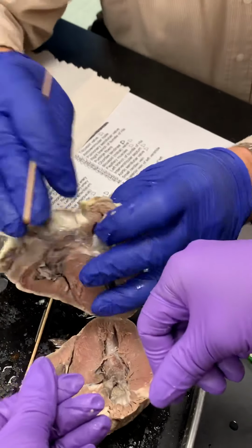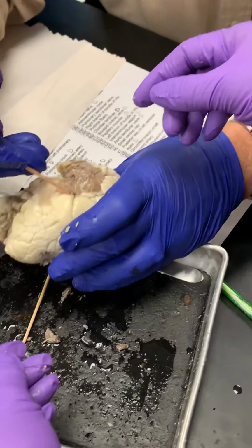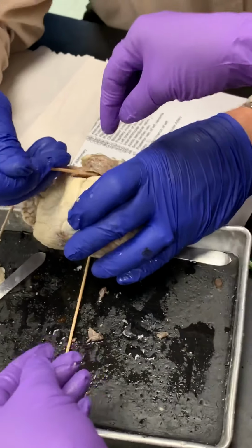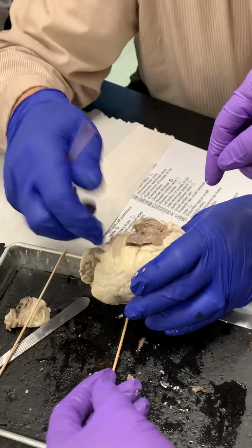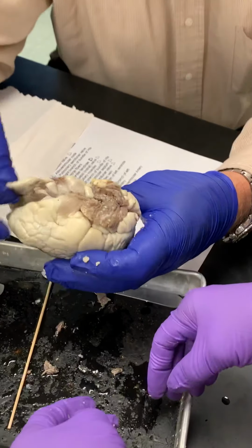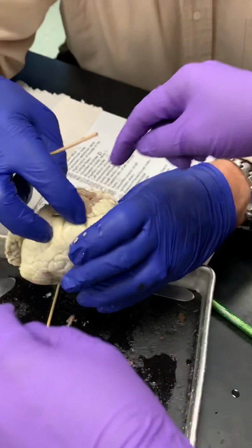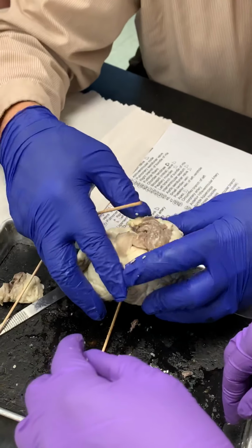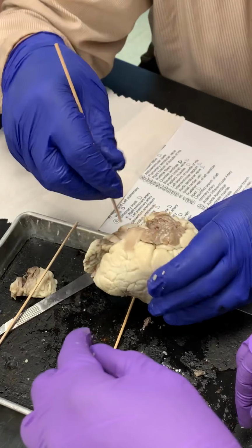And then, what's this over here? What chamber is this? So what structure is this first? Right, these ears, these appendages, these are the auricles. Is this right or left? This is the right, and so this one is left. Yes. So the auricle leads in, the left auricle leads into the left atrium.